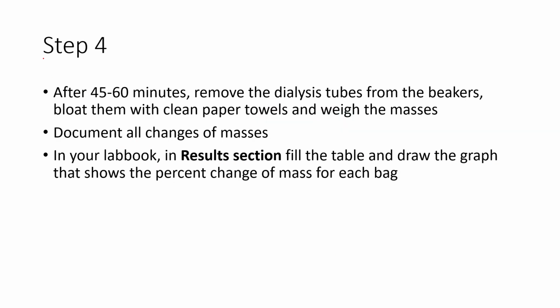So in the last video you will be shown the results. After 45 minutes we removed the dialysis tubes from all the water and solutions. We removed the water again and determined the masses. So you will see these masses and you will need to document the changes of the masses.